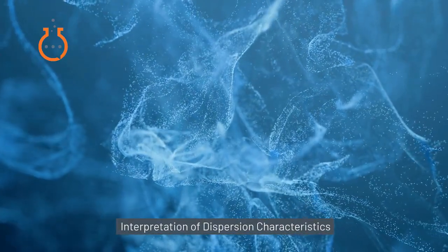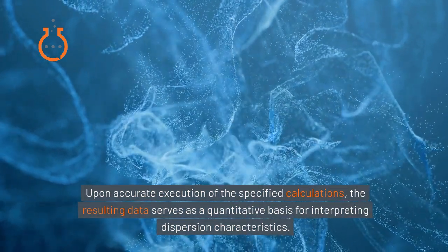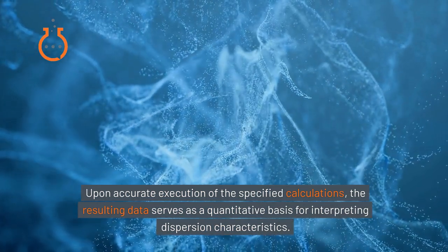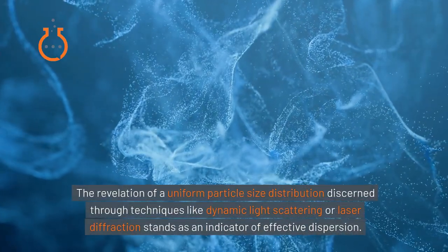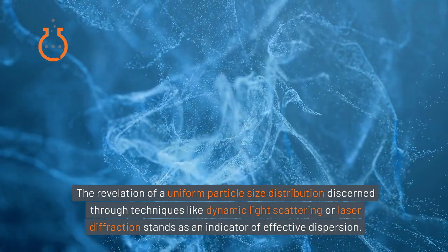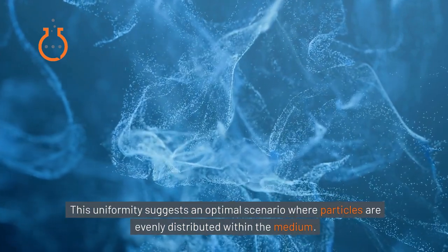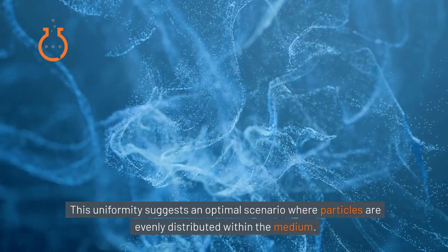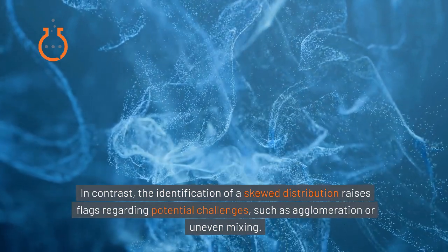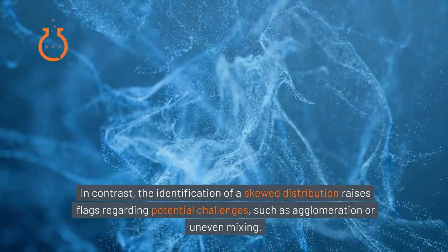Interpretation of dispersion characteristics. Upon accurate execution of the specified calculations, the resulting data serves as a quantitative basis for interpreting dispersion characteristics. The revelation of a uniform particle size distribution, discerned through techniques like dynamic light scattering or laser diffraction, stands as an indicator of effective dispersion. This uniformity suggests an optimal scenario where particles are evenly distributed within the medium. In contrast, the identification of a skewed distribution raises flags regarding potential challenges, such as agglomeration or uneven mixing.